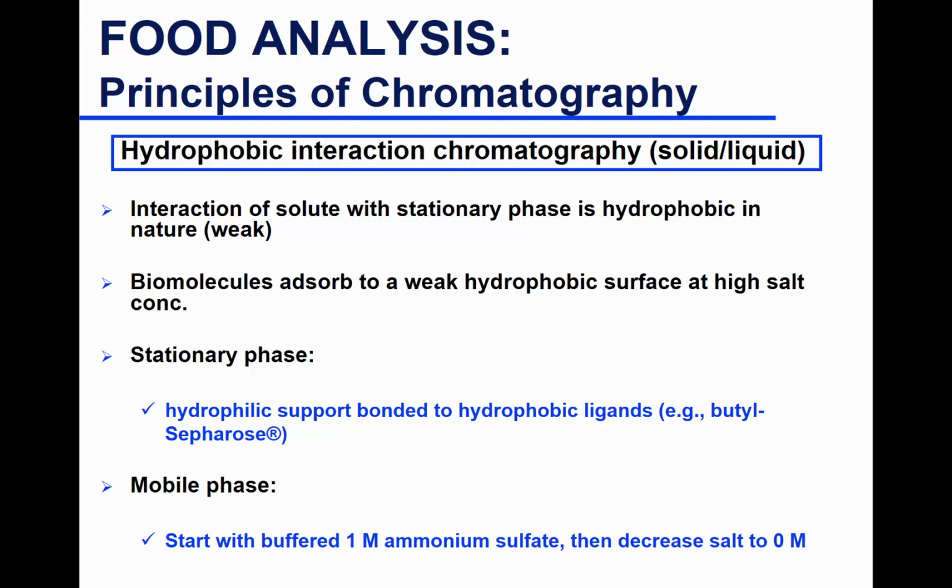A common support, a hydrophilic support bonded to a hydrophobic ligand, is butyl Sepharose. That's a common stationary phase that is used.